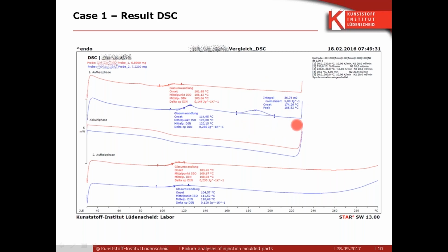Okay. If you polish it, it will also look like this one. But only here you can see an injection point, not in this case. So it's not crystallinity or something that is apparently different. Otherwise, you would essentially see it in a DSC curve. You would see some kind of recrystallization or so. Okay, which we don't see.